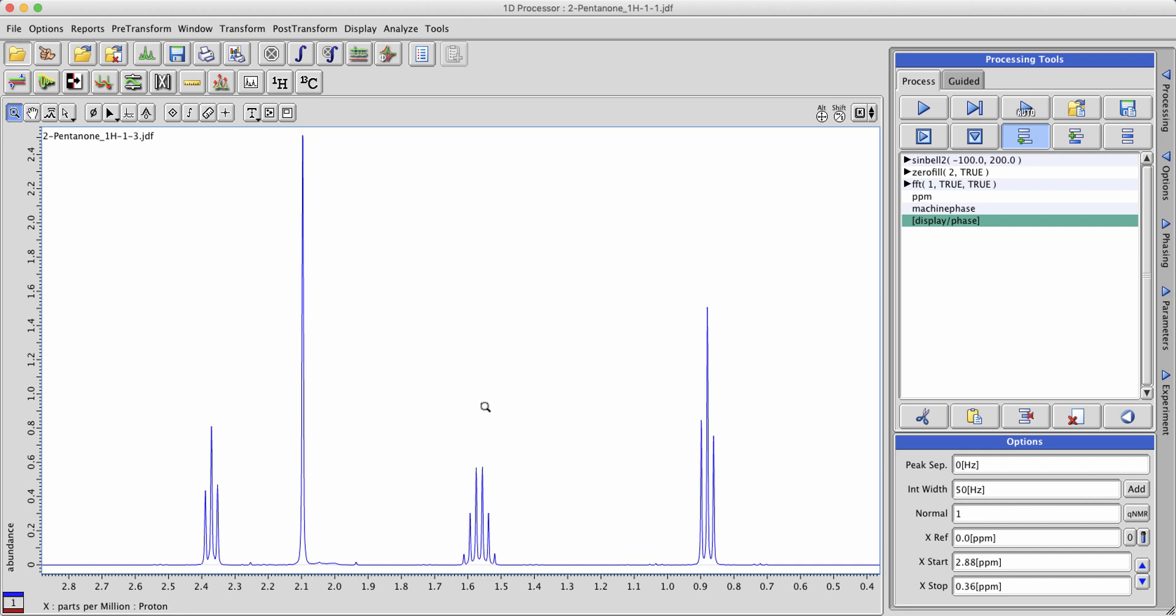Let's start with a few ways of creating integrals. Note that these methods will work whether you're in a 1D processor window or in a data slate. Let's start with manually drawing an integral.